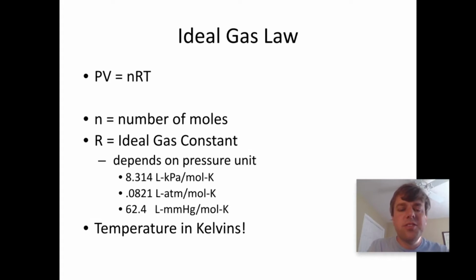Greetings, chemistry students. When we last left off, we were talking about the ideal gas law, and I've got a little lab that I'm going to demonstrate for you. As you watch the lab, pay attention to the data points that I record. It may be helpful for you to write them down.